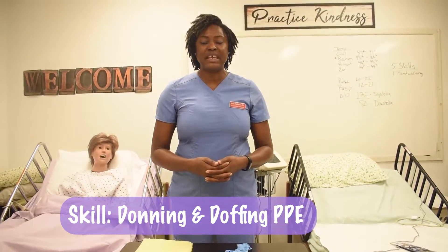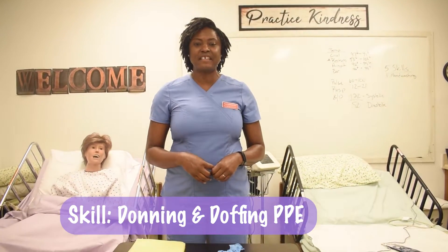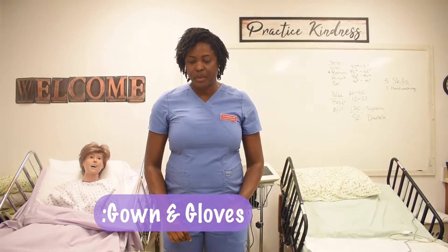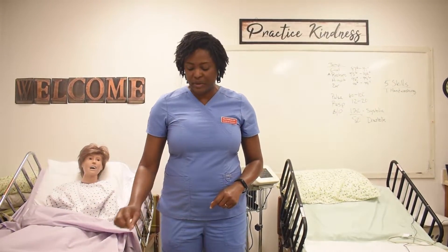Donning and doffing PPE — for this exercise we're only going to do the gown as well as the gloves. To begin with, let's start with the gown.